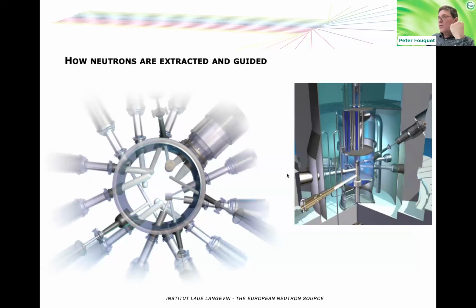Now, when you look at this assembly here, we have several fingers showing next to the reactor. And what we do there is we have several containers of cold liquids next to the reactor, just to tune the distribution of energies of the neutrons. The colder the source, just like a light source, the colder the light. And I show you in a little film here how this is done.